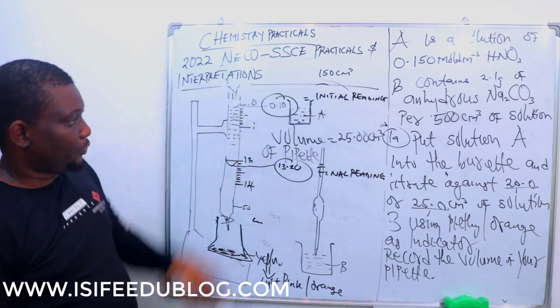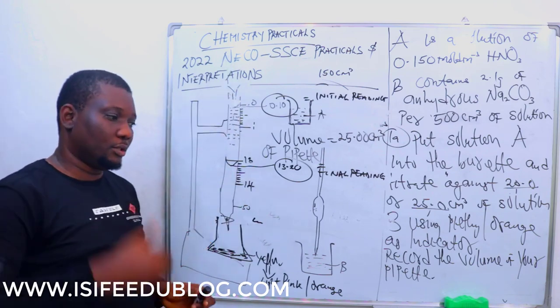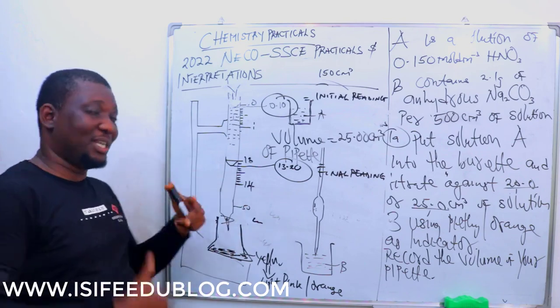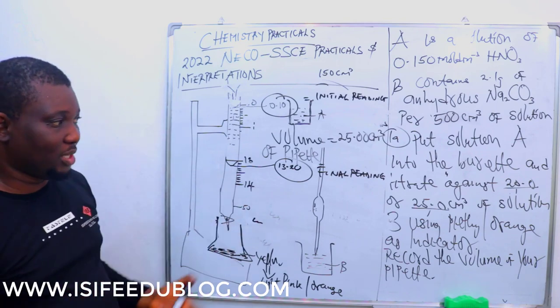So this is the first titration that we've done. Follow the same pattern for the next one. While you are doing it several times, make sure that the readings you're obtaining give the same result and are still in concordance. That's why it's an experiment, that's why it's chemistry.